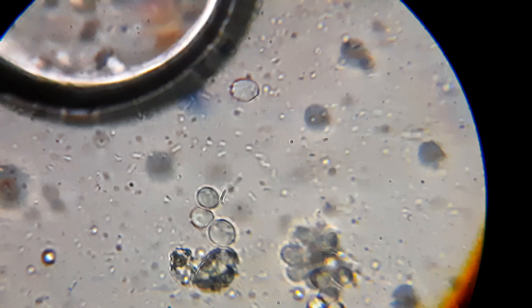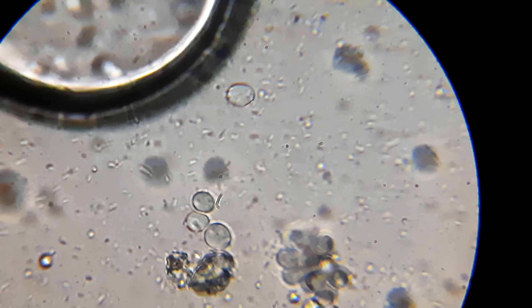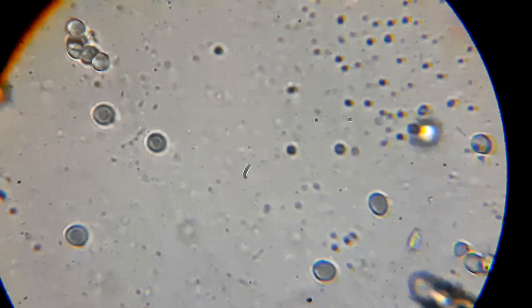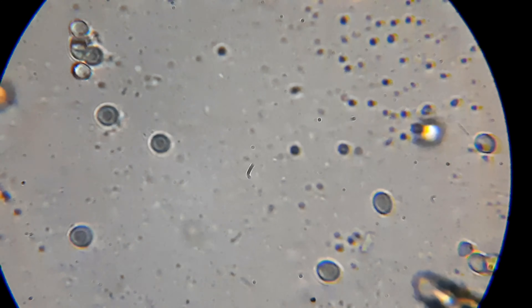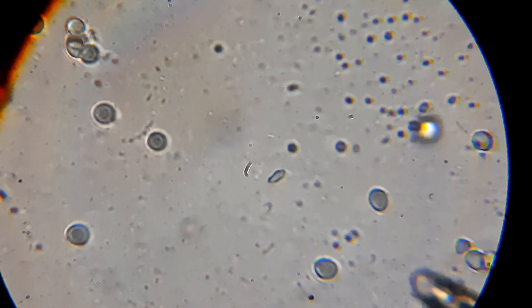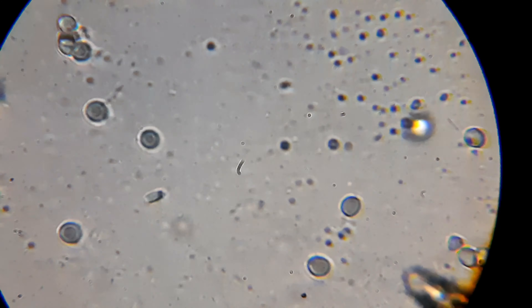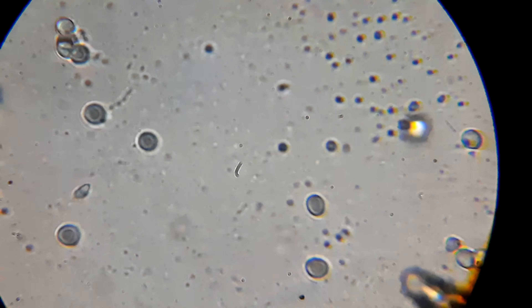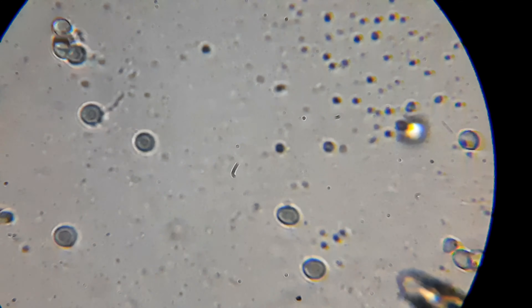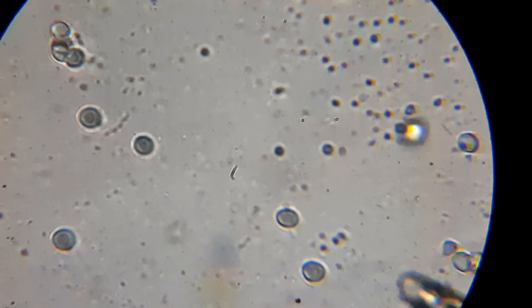I just wanted to apologize — those black squirts are getting higher and higher and I'm getting helpless just adjusting the camera on a single place, sorry about that. Thankfully, here's a clean place where we can view the spores much more clearly. This is actually at 1500 times magnification.